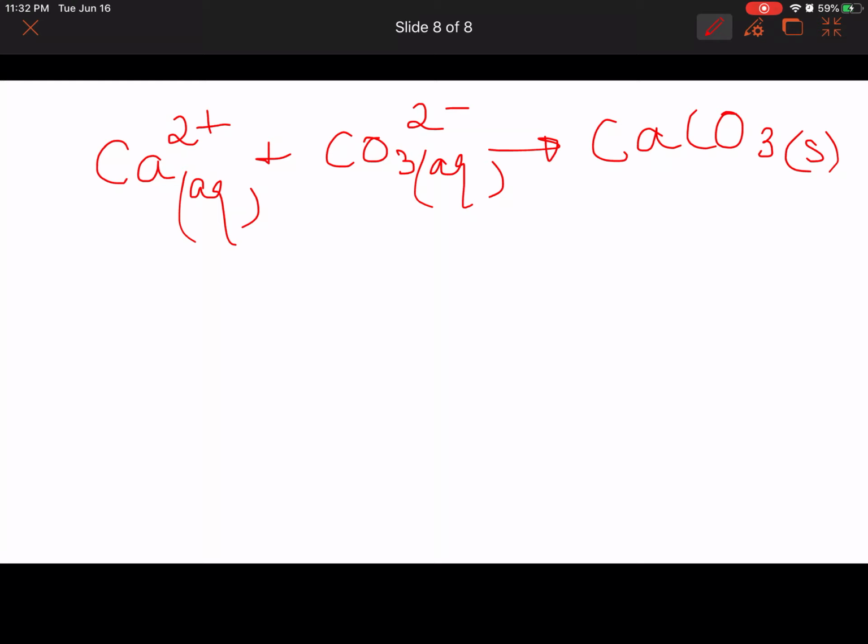And then use the space below to show your work for the theoretical yield and percent yield calculations. So you can show in the next space in your handout how you did all your calculations for the theoretical yield and then the percent yield. Okay, so that's about it. And for trial 2, you can do your calculations on your own by following the same procedure.